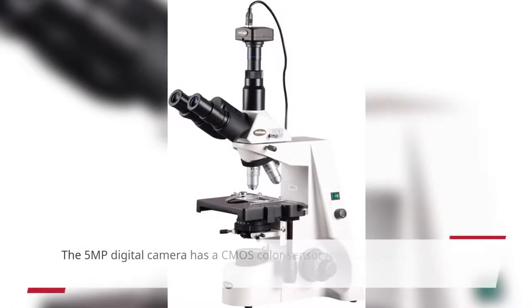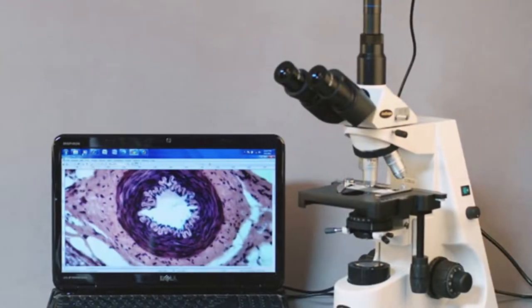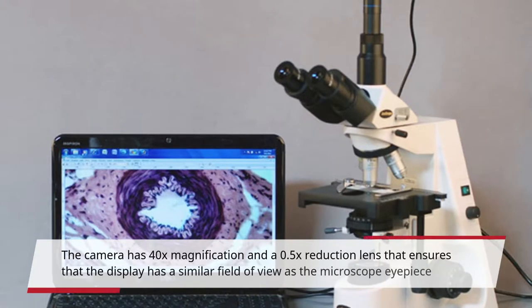The 5MP digital camera has a CMOS color sensor for displaying still microscopy images and streaming live videos to a computer or projector. The camera has 40x magnification and a 0.5x reduction lens that ensures the display has a similar field of view as the microscope eyepiece.